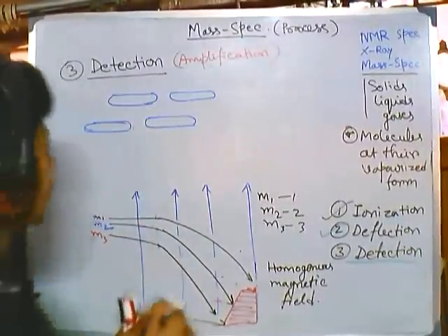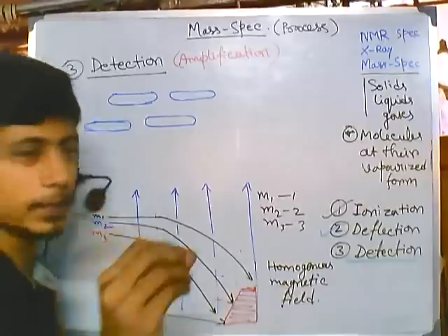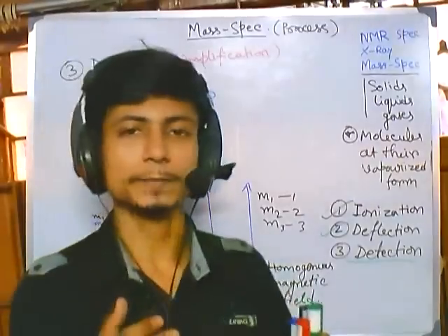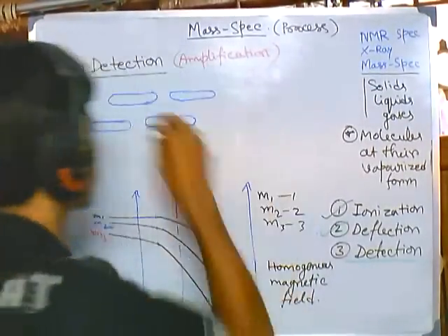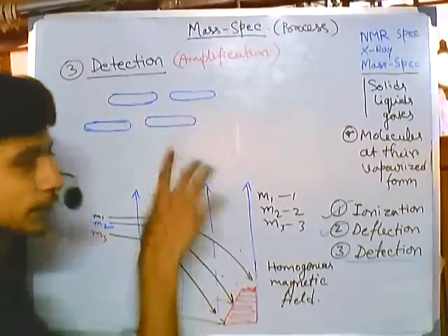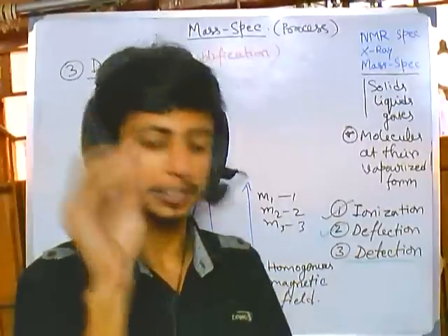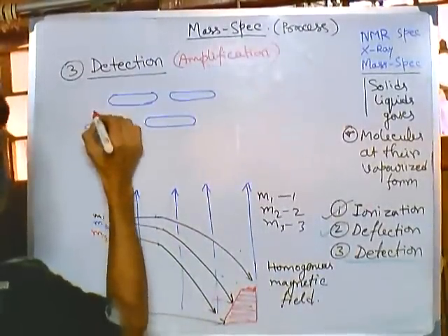Like that. So these are dynodes arranged inside the detector. It's a very simple detector. We have four dynodes. The importance of the dynodes: you guys tend to play the ping pong game, right? In those games, the balls are jumping and hitting different regions. Here the exact same thing is happening. Those electrons will be acting as those ping pong balls.